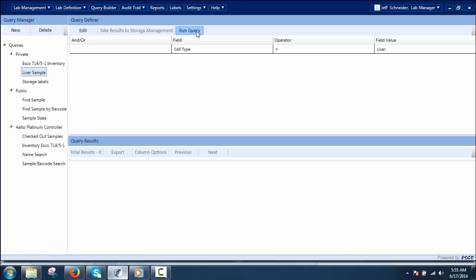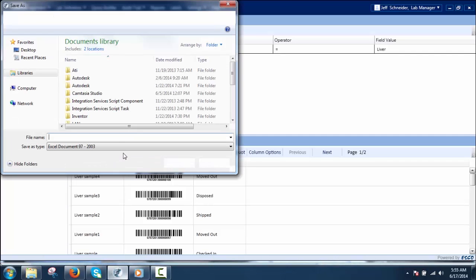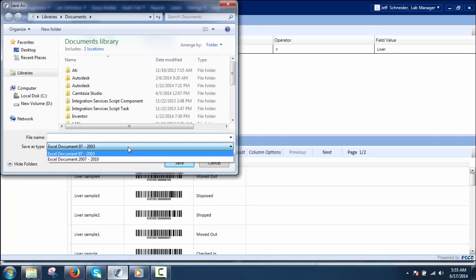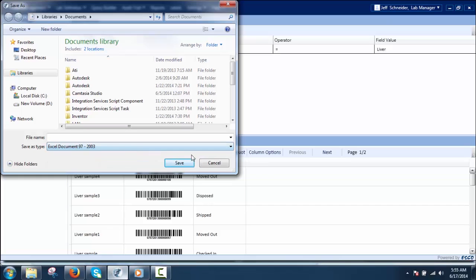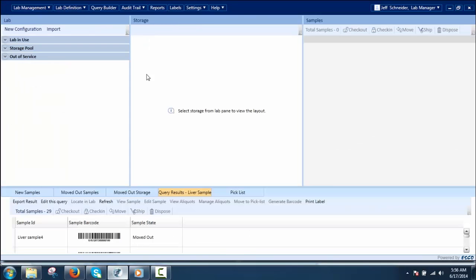The steps to run a query are: first, select the query from the Query Manager pane, then click Run Query to view the results for the selected query in the Query Results pane. In this way, a user can run saved queries and get results for further actions like export or to take results to storage management.